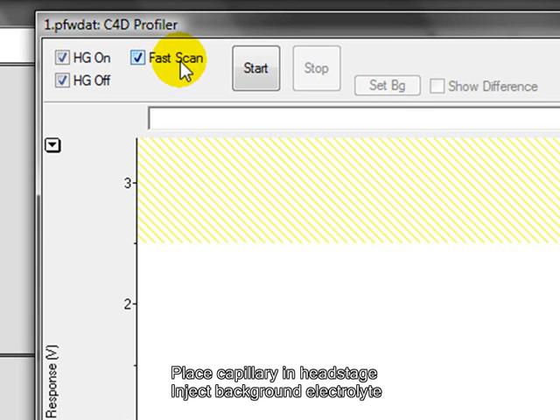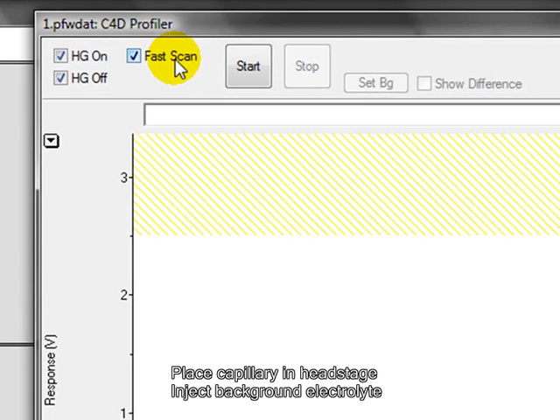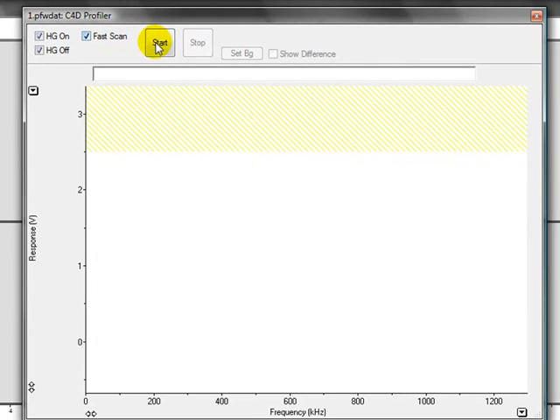So you should put a capillary in the head stage and inject your background electrolyte into the capillary. When you are ready to run, you click start.